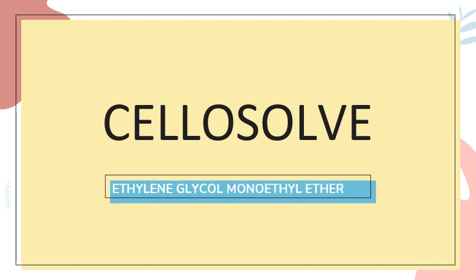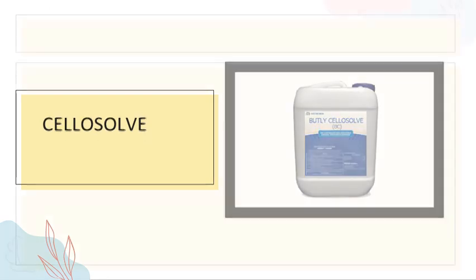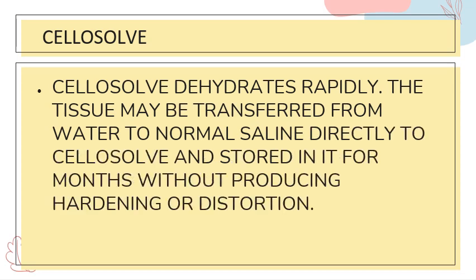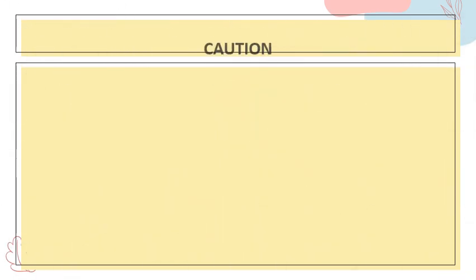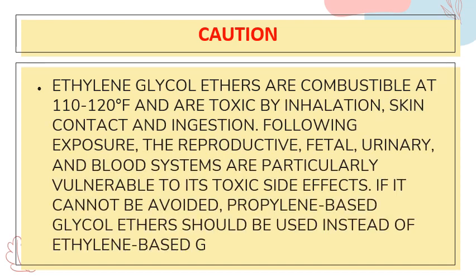Next, we have the cellosolve, or the ethylene glycol monoethyl ether. Please memorize that. So cellosolve dehydrates rapidly. The tissue may be transferred from water or normal saline directly to cellosolve, and stored in it for months without producing hardening or distortion. Caution, ethylene glycol ethers are combustible at 110 to 120 Fahrenheit and are toxic by inhalation, skin contact, and ingestion. Following exposure, the reproductive, fetal, urinary, and blood systems are particularly vulnerable to its toxic side effects. If it cannot be avoided, propylene-based glycol ethers should be used instead of the ethylene-based glycol ethers.